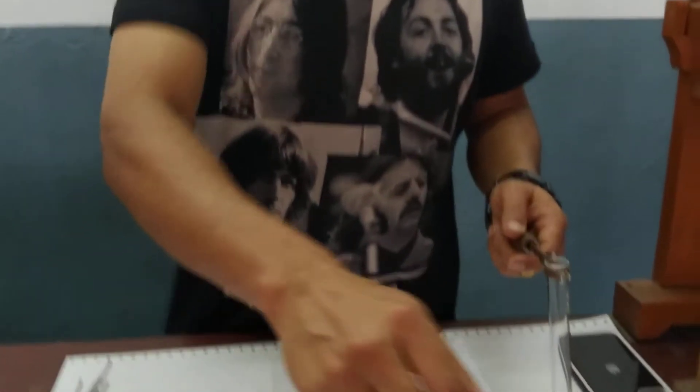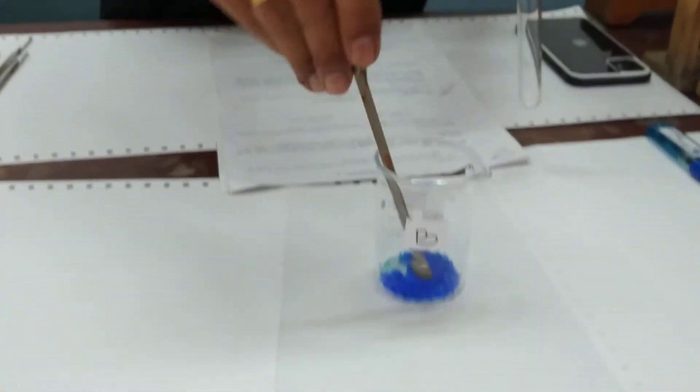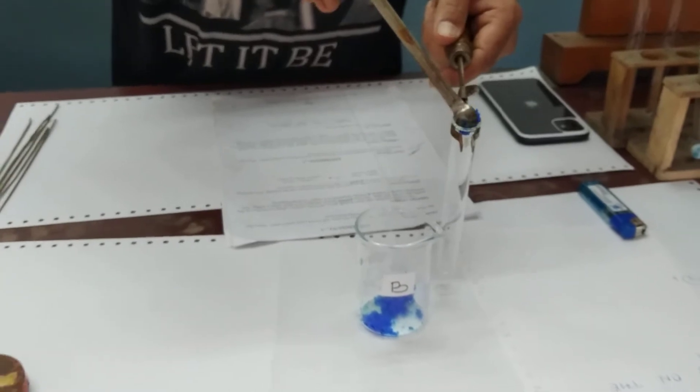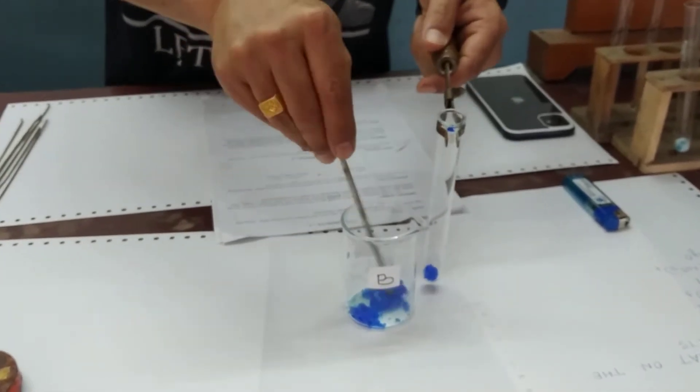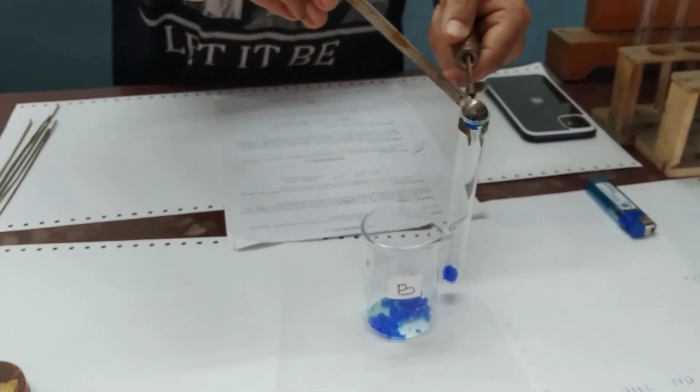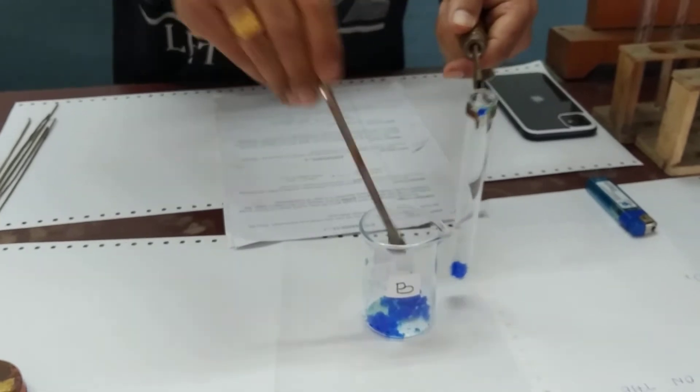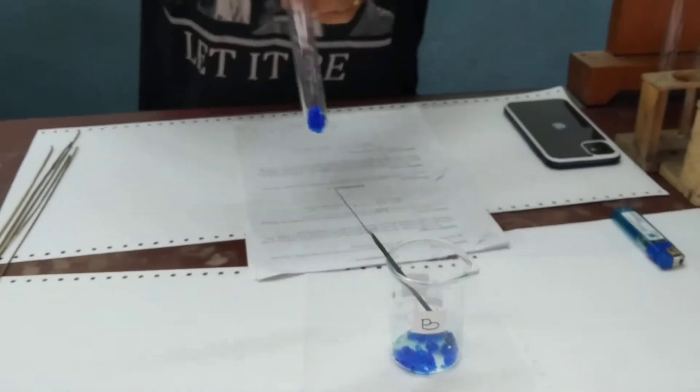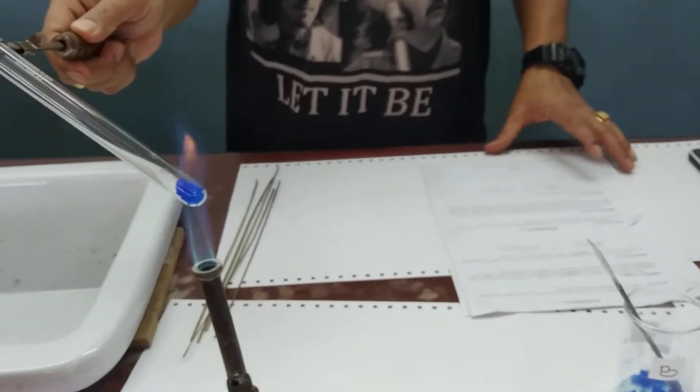Now we move on to experiment number two. We take sample B, a blue crystalline solid. It has absorbed a little moisture and become slightly sticky. We put it in a test tube.